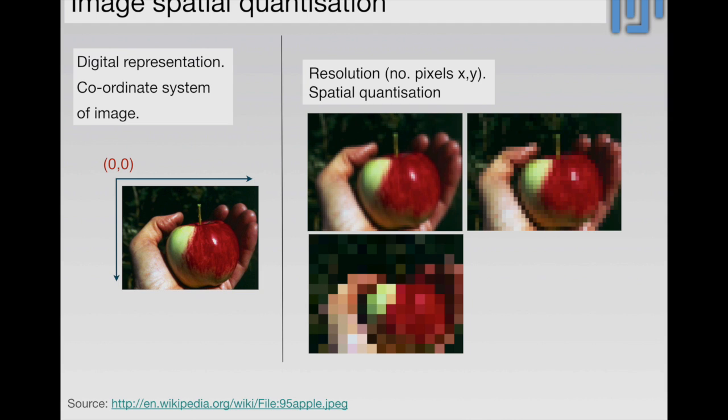Now this is somewhat distinct from microscopy resolution, where we use resolution to describe the resolving power of your microscope, so the optical ability to resolve certain details. So we use the same word, but it has a somewhat different meaning. But when you do an imaging experiment, it's not always the best idea to have the highest resolution possible. You should really potentially downsample your image in terms of resolution appropriately to the question that you're trying to ask.